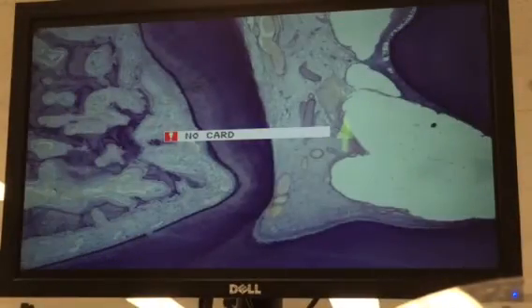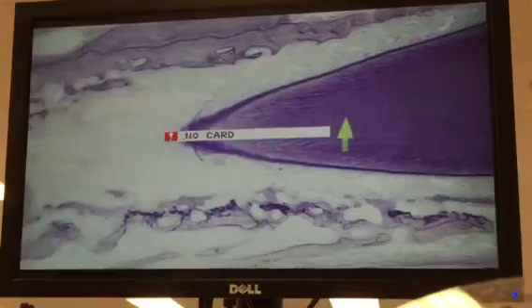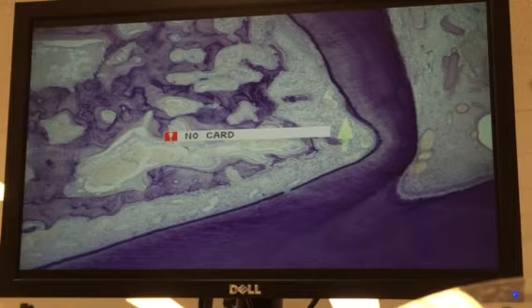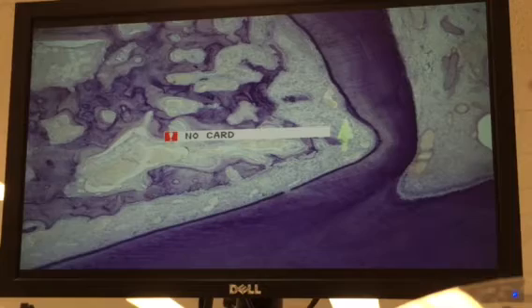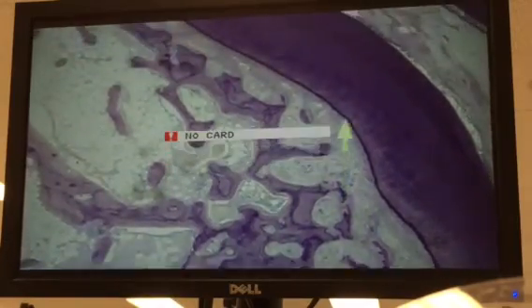So let's go down in magnification a bit. And we can see one root going down in that direction, another root just barely over here. And so right here, since it's right in the crotch, those are the interradicular fibers. They kind of irradiate out in a number of different directions. So those would be on the sections of teeth that came from Dr. Caldwell.